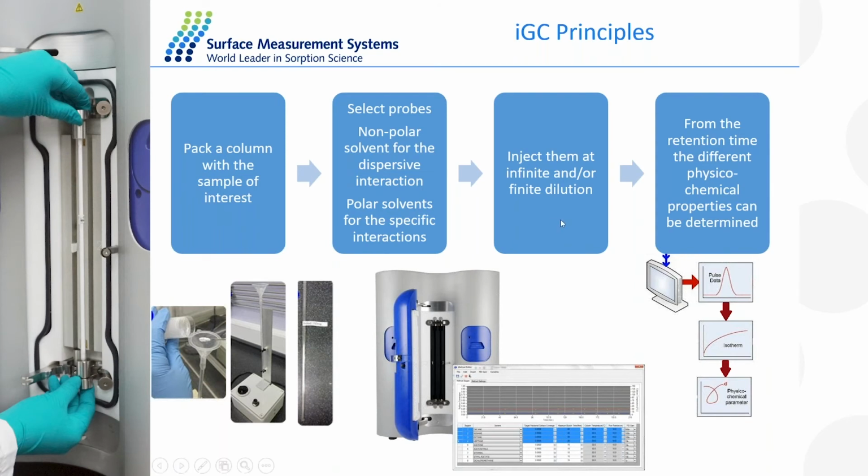We can then choose how to inject them. So we can inject them at very small concentrations, at infinite dilution, and also at larger concentrations. And from the interaction with the sample, we will obtain different retention times. And from this, we can analyze these peaks and obtain different physicochemical properties.